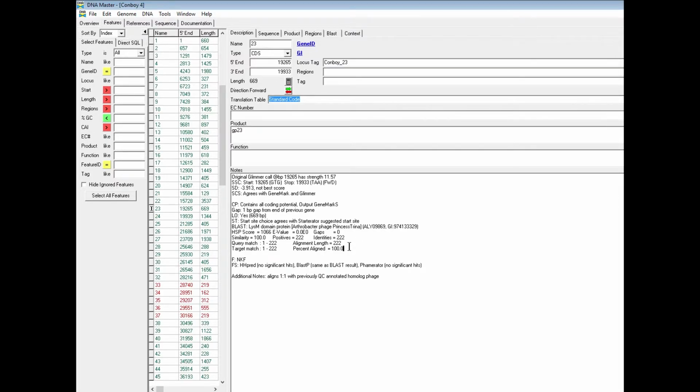As you can see, it lets the people working at quality control know all of the information without them having to switch over and export the table themselves. So that's all you have to do for that one. That's a pretty easy one.